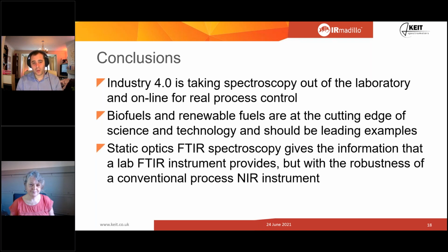So I have built robust and usable calibrations off of just 10 spectra because it was a relatively simple mixture and worked quite well. I've got one customer where I've had to use 400 spectra because their process is so horrifically complicated that you need that much. Now, a near infrared spectrometer would have needed 800 spectra. But that's their process, not the spectrometer. In general, it's about 30 to 40 to get most calibrations. And that's relatively achievable. If you think you're taking 3 or 4 samples a day, it's a couple of weeks. It really isn't that long to get something up and running. Thank you. Next question.